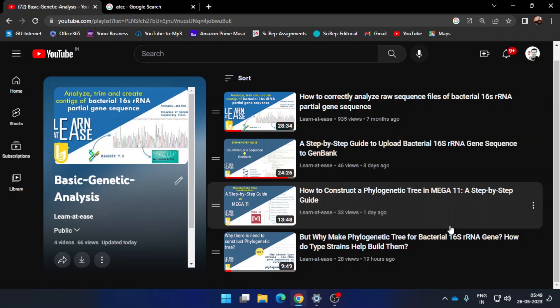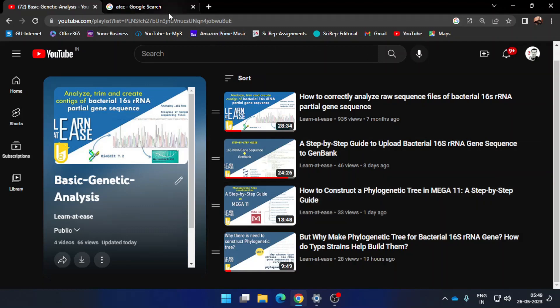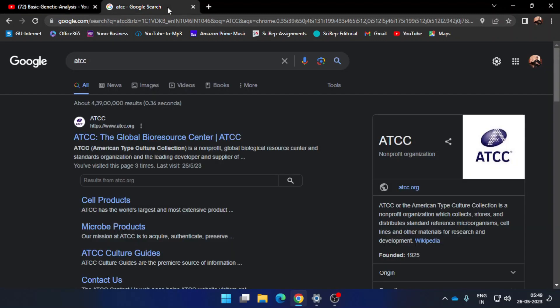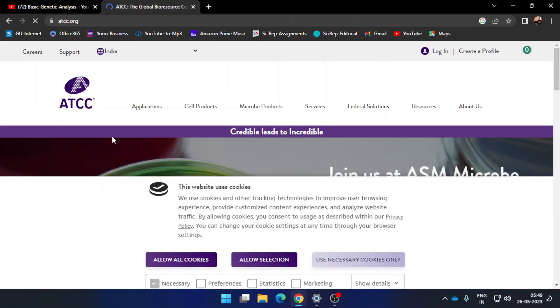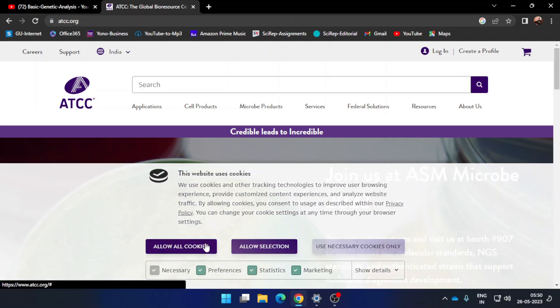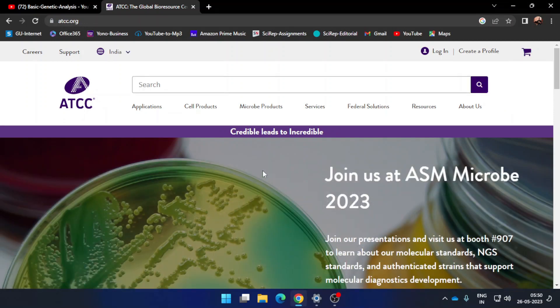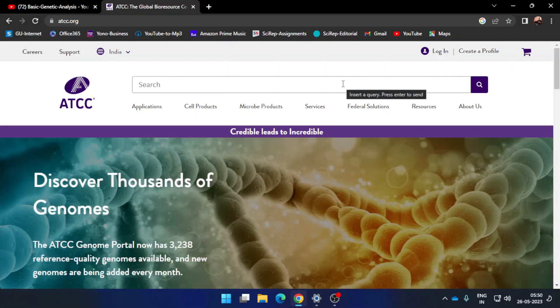First, go to your web browser and type ATCC, which stands for American Type Culture Collection, and go to the webpage atcc.org. In the first search bar you need to give the name of the genus for which you want to search the type strains.